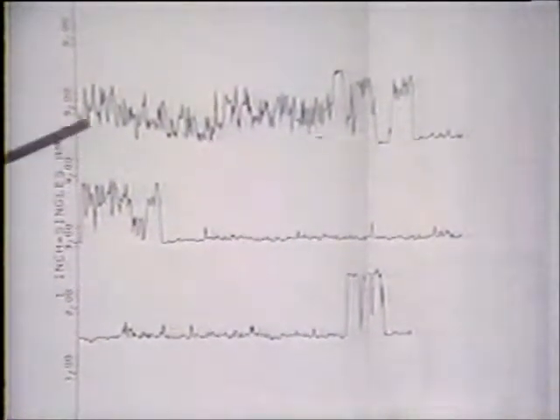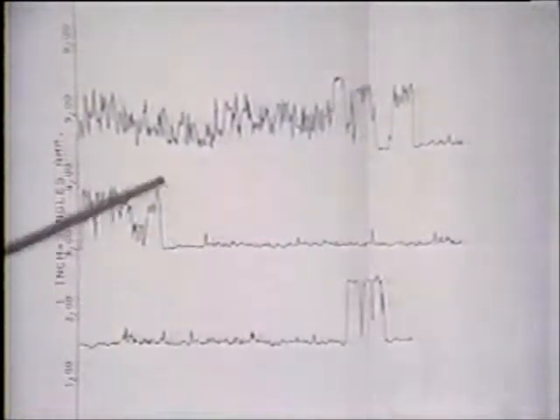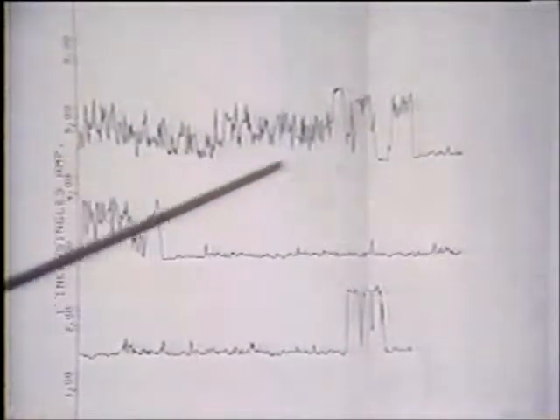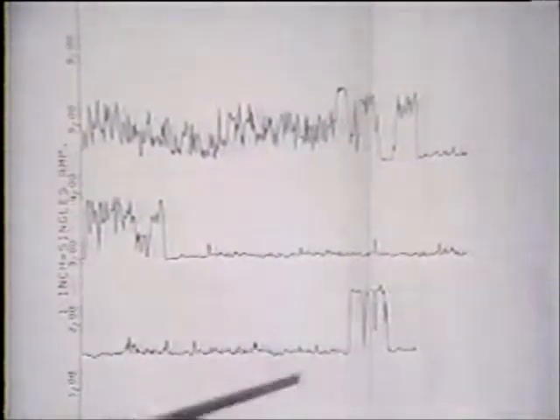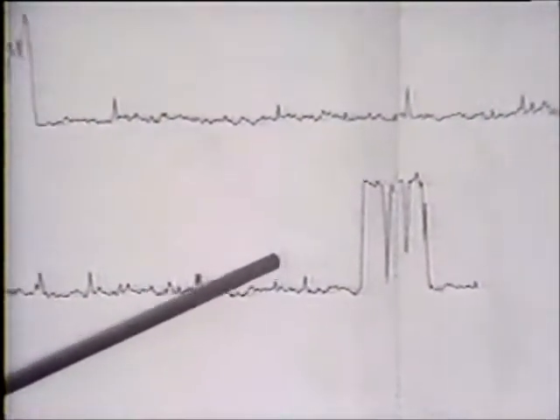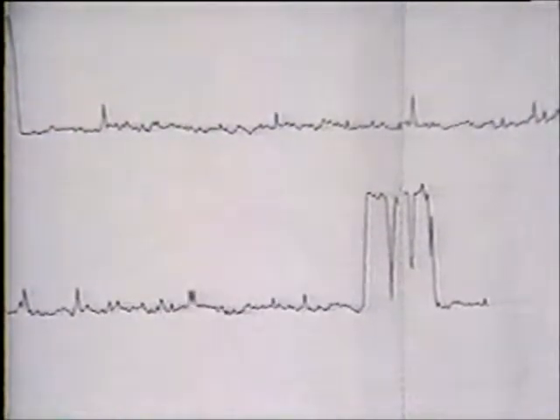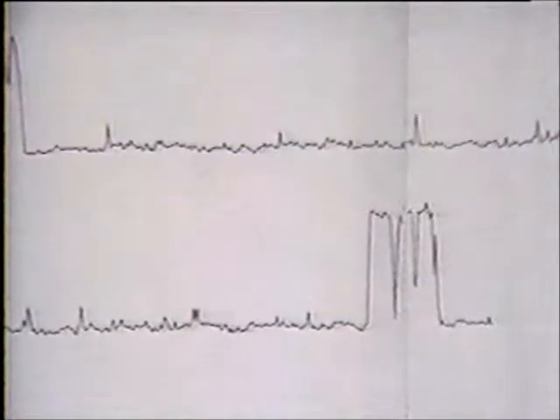As you can see, there is a substantial variation in the mean current from the beginning to the end of the record. The record runs this way. In fact, you see bursts that occur on a time scale that's 1,000 times slower than the original data record. This says that if you lumped all those kinetics together, you would get a very confusing answer.